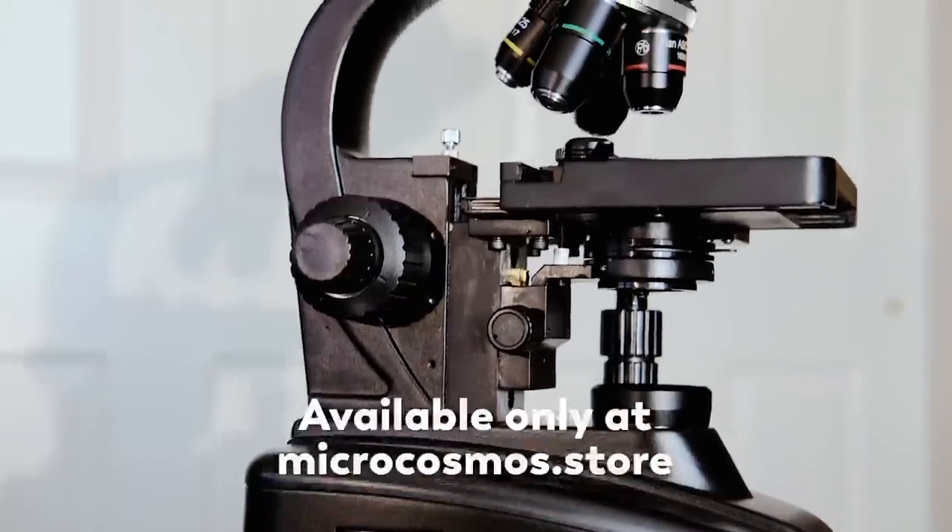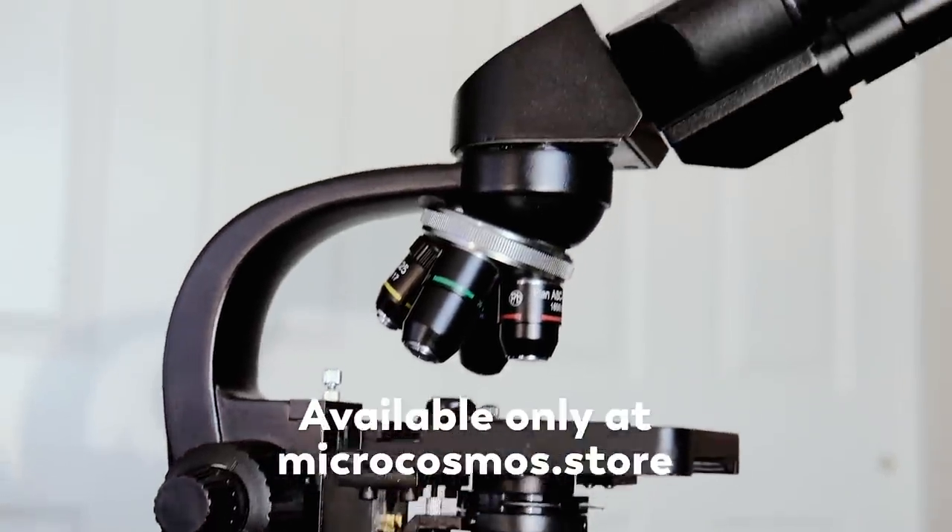Hello, I'm Hank Green, the guy whose voice you hear in a lot of Microcosmos videos. This is my face, and this is my office, and I'm here to unbox the base model of the Microcosmos microscope.